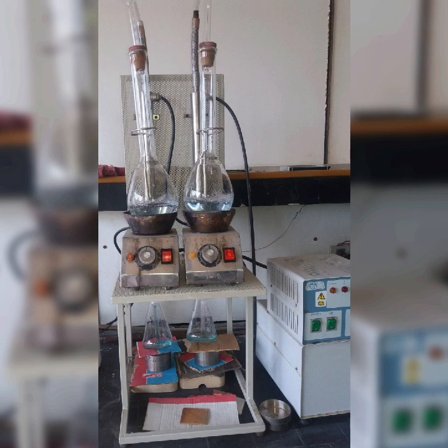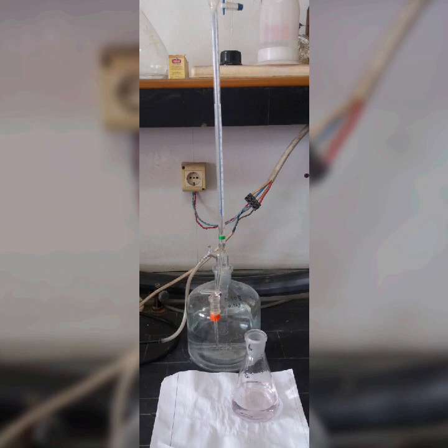This is where chemistry meets math. We now have our captured ammonia and acid, and we need to figure out exactly how much is there. We do this by adding a known concentration of sulfuric acid until a precise color change, usually purple, signals the endpoint. You might be asking, how does color tell us about protein? Well, the color change marks the chemical equivalence point, meaning all the ammonia has been neutralized. This is a classic acid-base titration.